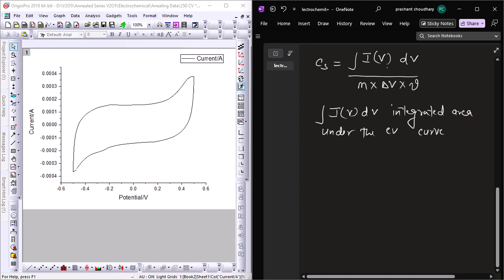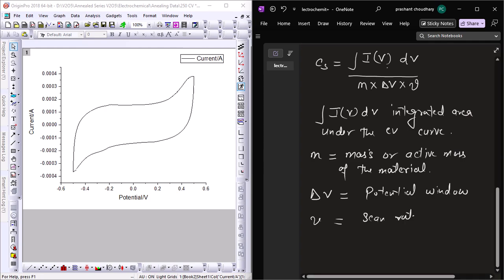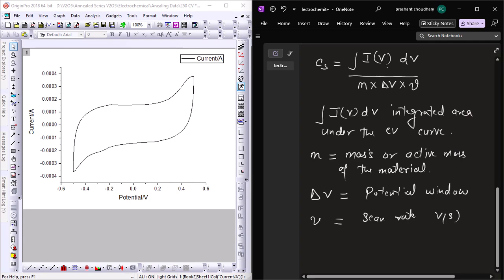In this formula, m equals the active mass of the material, ΔV (capital V) is the potential window, and small v represents the scan rate, typically measured in volts per second. The potential window is V2 minus V1. So we know everything about the formula; we just need to find the area under the curve from the CV diagram.